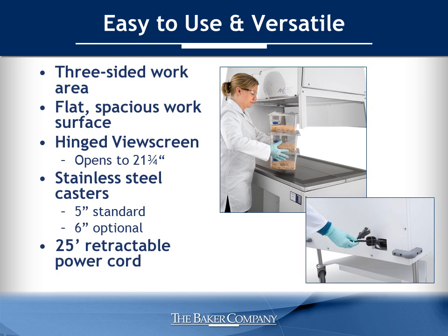The AniGuard E3 is easy to use and versatile. Its three-sided work area permits access by multiple operators, facilitating team-based projects. The flat, spacious work surface allows cages in a variety of sizes to be pulled in and out quickly. A hinged, scratch-resistant view screen opens to 21¾ inches for moving large items in and out of the work area prior to working in the cabinet, allowing greater visibility and access. Standard 5-inch stainless steel casters with optional pull bars allow for easy maneuverability. A 25-foot retractable power cord provides greater range of use without unplugging, and the casing is located within the base of the design to avoid hits in the facility when moving around.